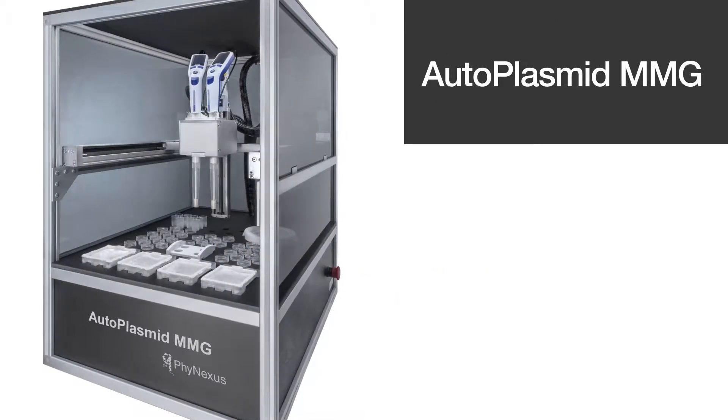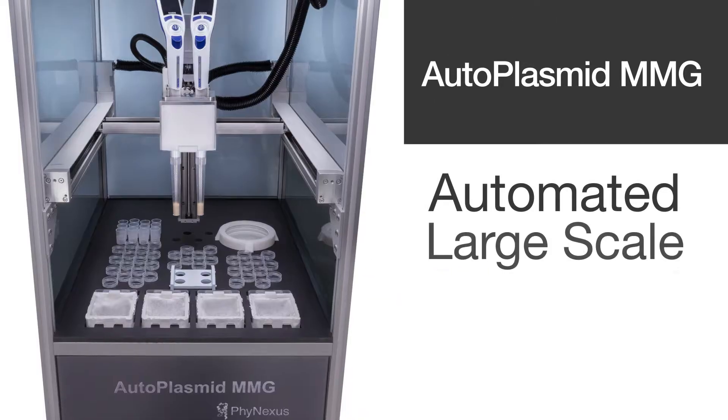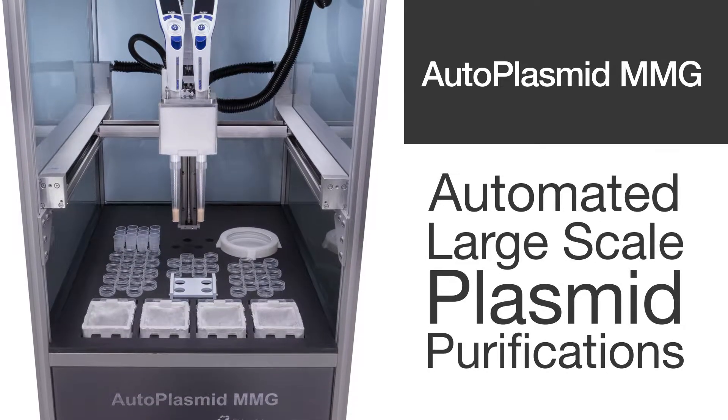Introducing the new Autoplasmid MMG from Phynexus for automated large-scale plasmid purifications.